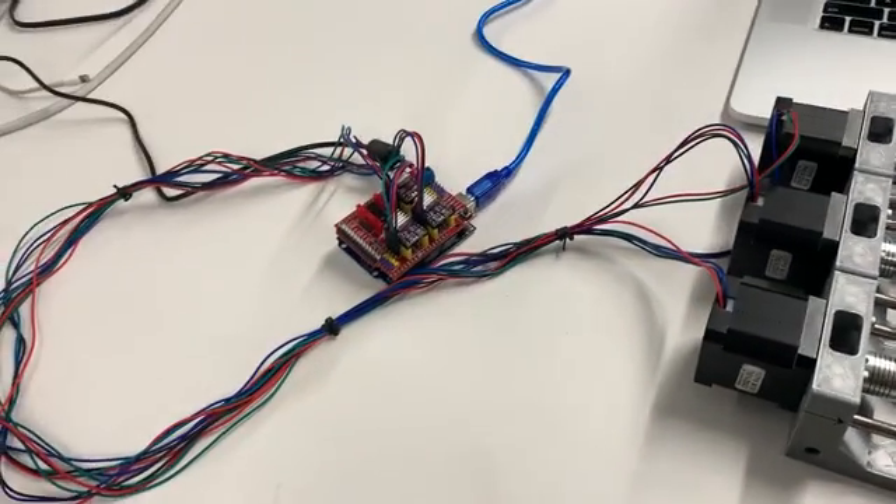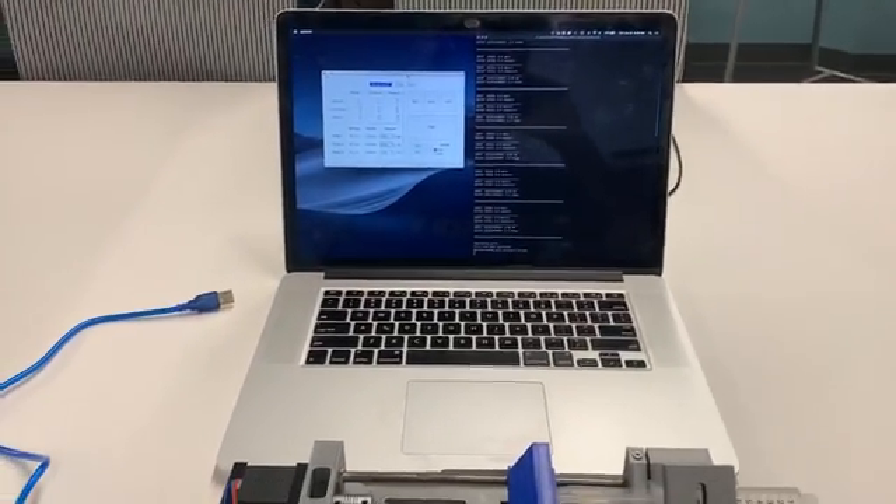Now that we have the pumps assembled as well as the electronics board assembled, we're going to go ahead and show you how to run the pumps for the first time.